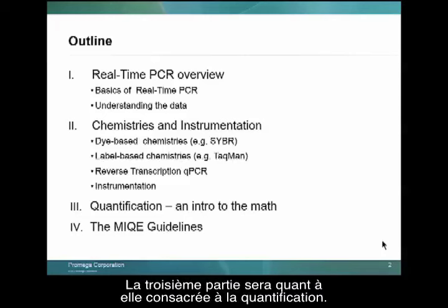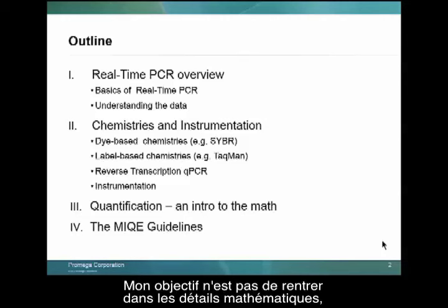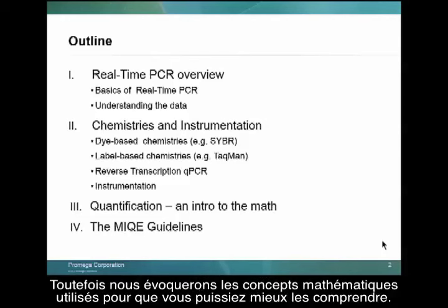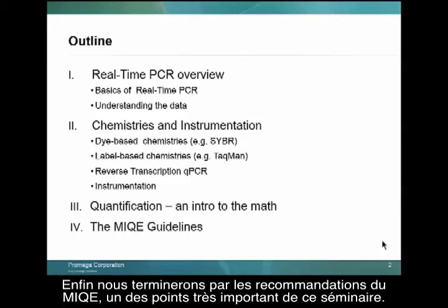In the third part, we'll touch on quantification. I don't want to delve too deeply into it here. I think there are a lot of very good resources online, but we will talk about the math involved so that you have a better understanding when you look at those resources. And we'll end with the MIQE guidelines, which are probably the most important point of this talk.